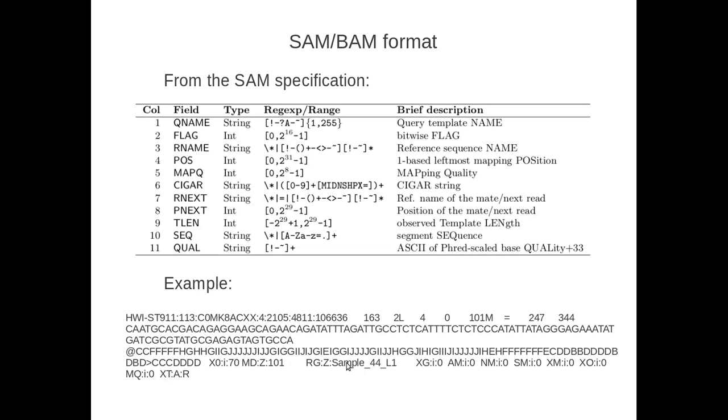In human sequencing, frequently you're sequencing across multiple libraries for the same individual, or in other cases from different lanes. The whole sequencing strategy is important in some cases to interpreting the output data, and the read group helps you know something about the sequencing strategy without having to report all of that information for each read in a very large file. Instead you just refer to the read group in the header, which explains all of that information for this particular read.